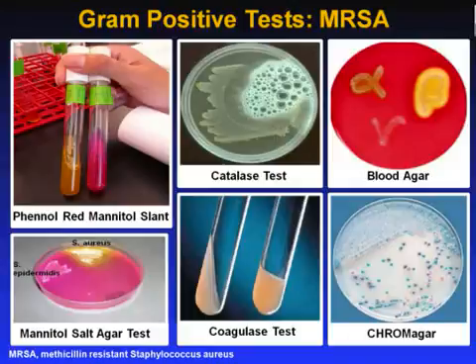Blood agar is used frequently to grow out most organisms, but it can act as a differential media as well. It differentiates bacteria on their ability to lyse red blood cells. The media contains sheep's blood agar and nutrient agar. If a bacterium lyses the red blood cells, then a zone of clearing is formed around the colonies. The zone of clearing can vary in magnitude based on the organism's ability to perform hemolysis.